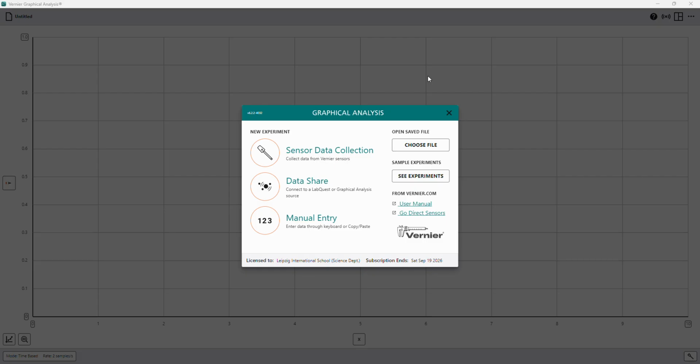The Vernier Graphical Analysis, as you probably have understood, is the software developed by the company who creates most of the sensors that we have in our lab. The first thing it allows us to do is connect the sensors directly with an interface of our laptop or iPad, record all the data, and then subsequently edit, process and plot all of this data on a specific platform.